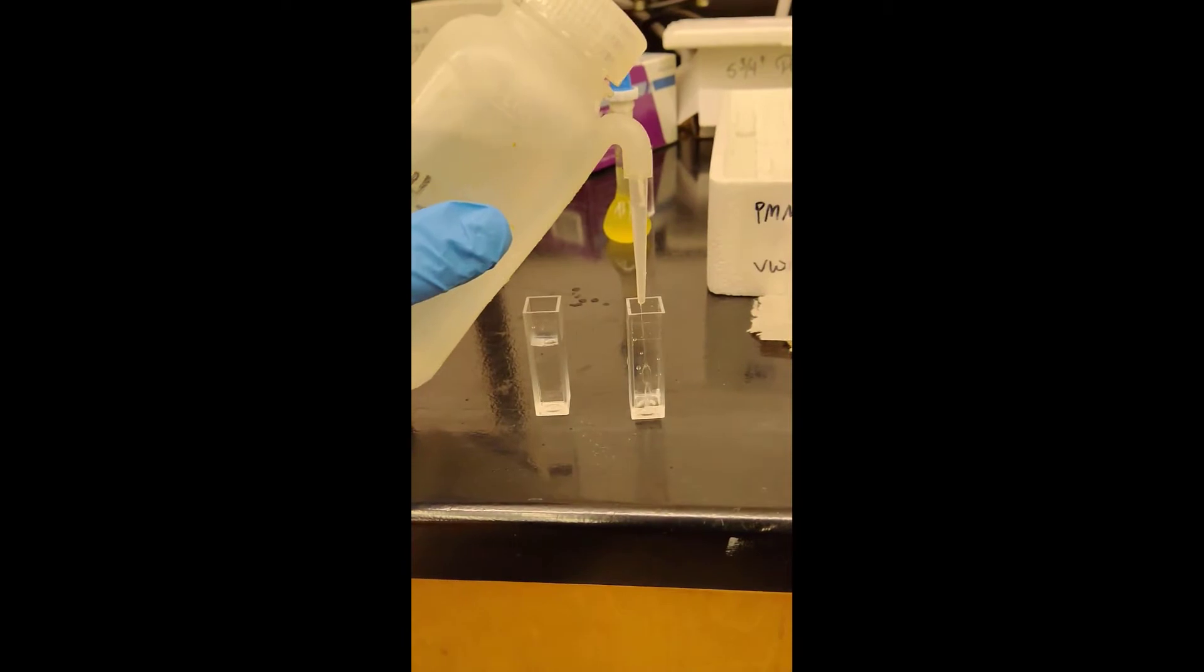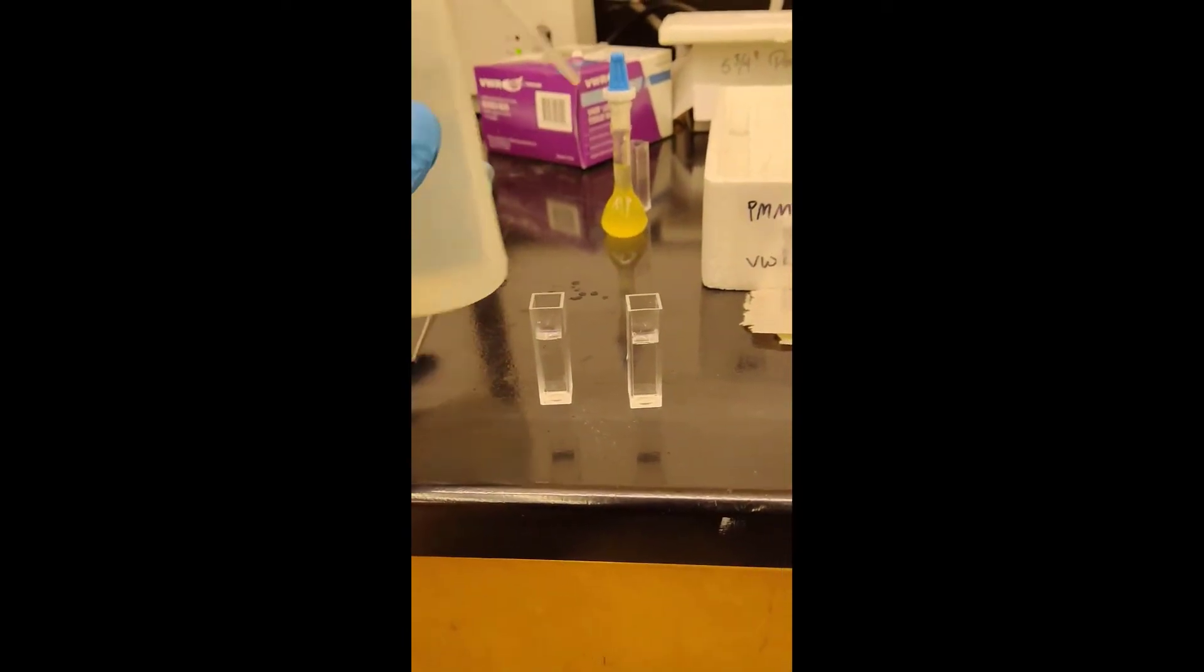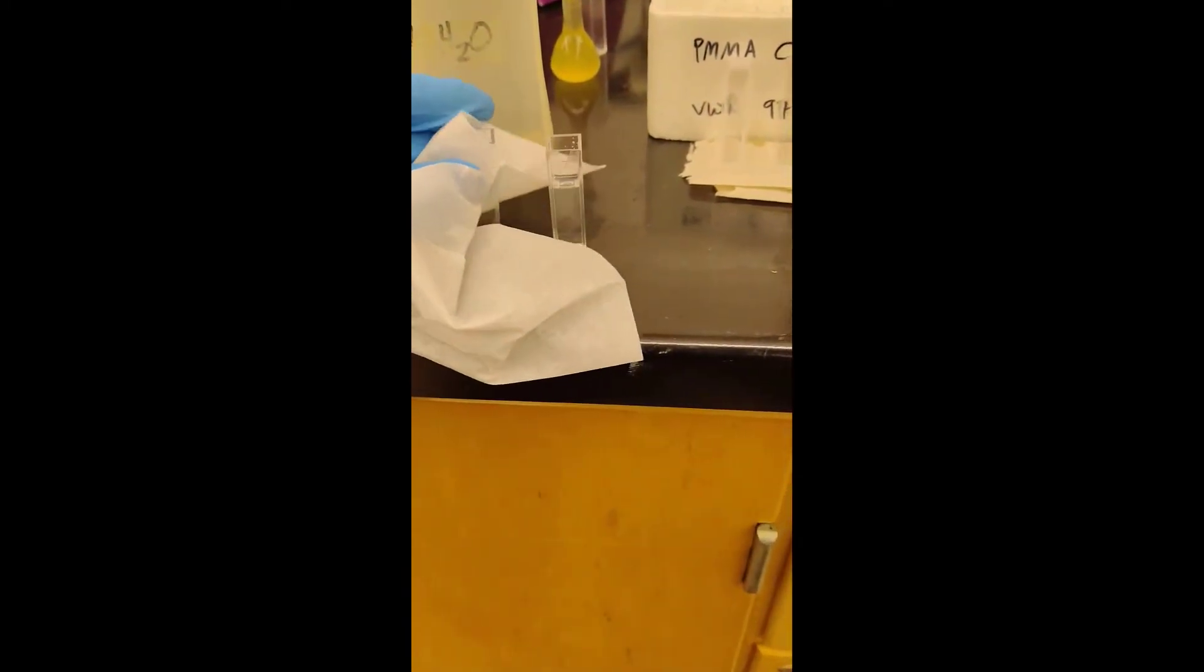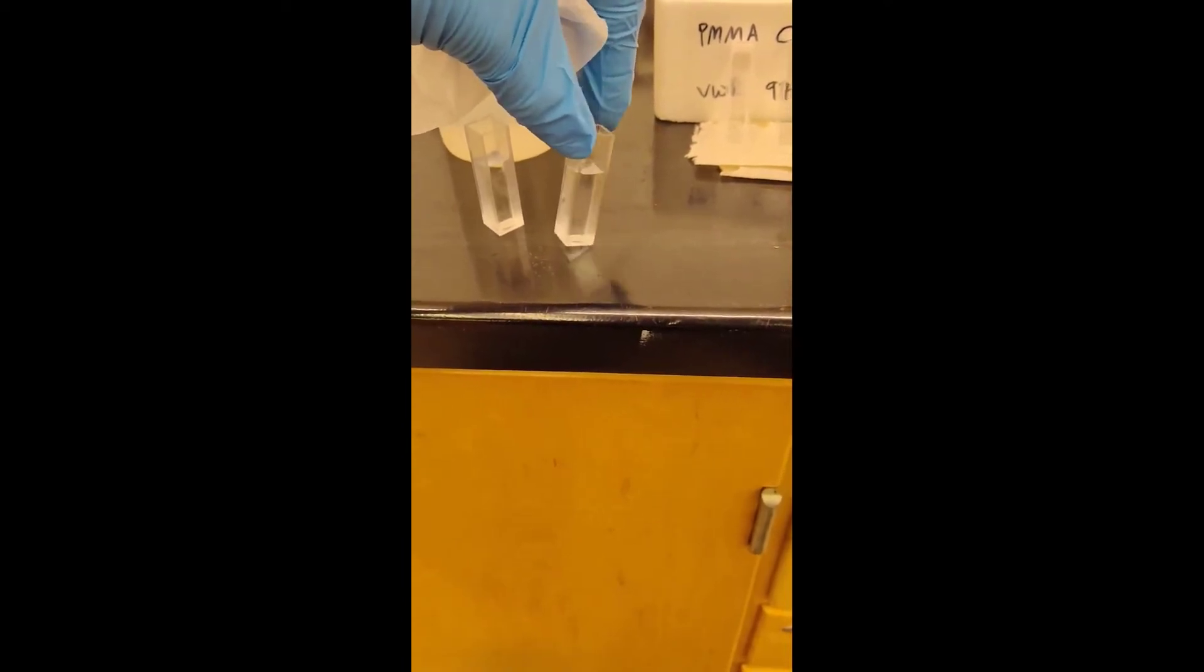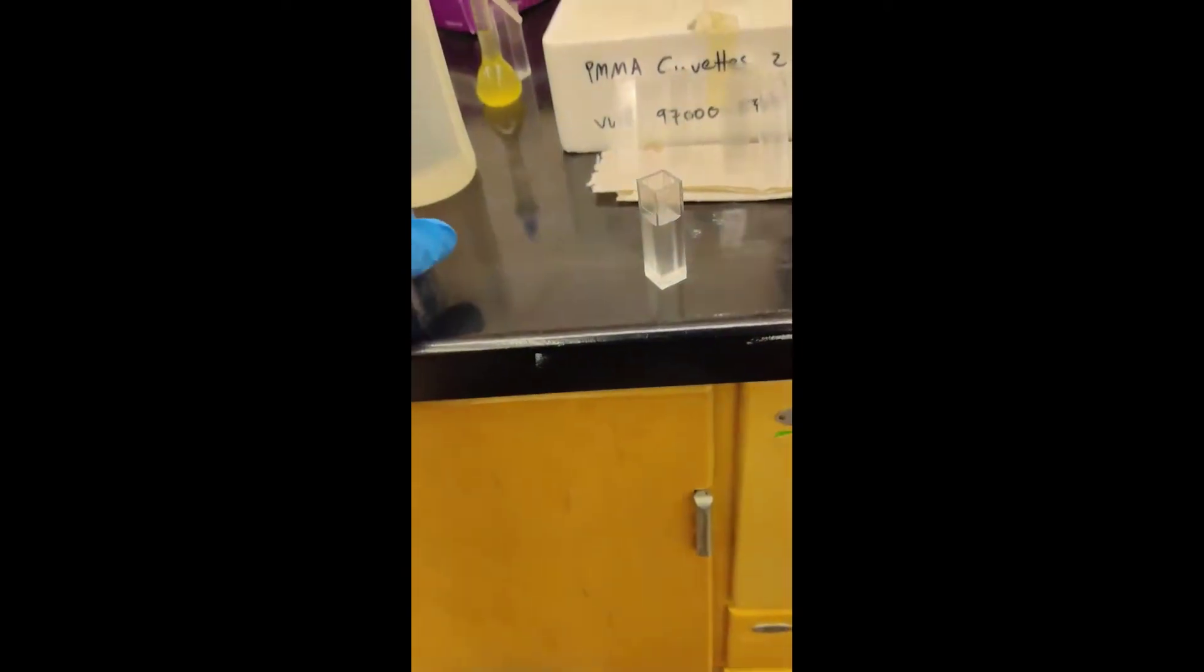Right here I'm filling up two clean PMMA cuvettes with DI water, filling them about two-thirds of the way up. I'm going to grab a kimwipe and wipe down the sides of the cuvette really thoroughly to make sure there are no fingerprints or anything else on them. The cuvettes have two different sides: an opaque side and a transparent side. The light is going to be shining through the transparent sides, so make sure the transparent sides are really clean.